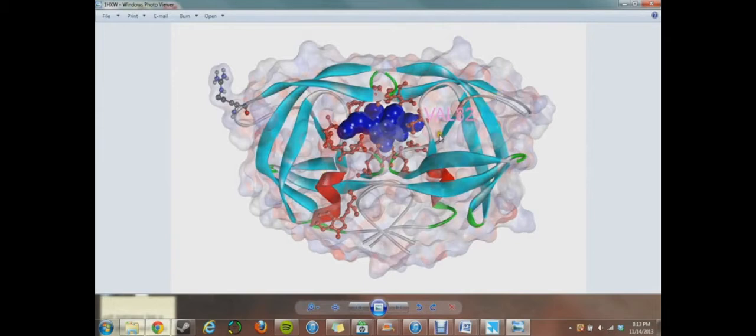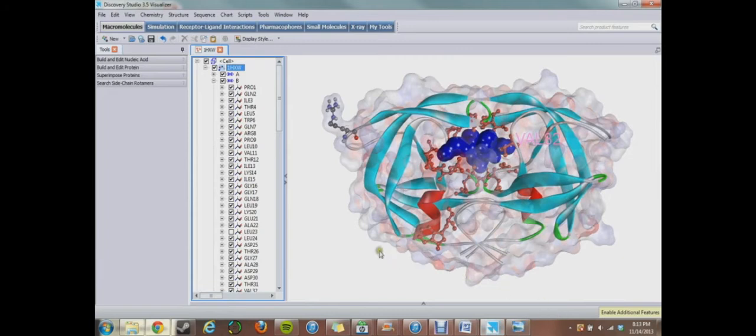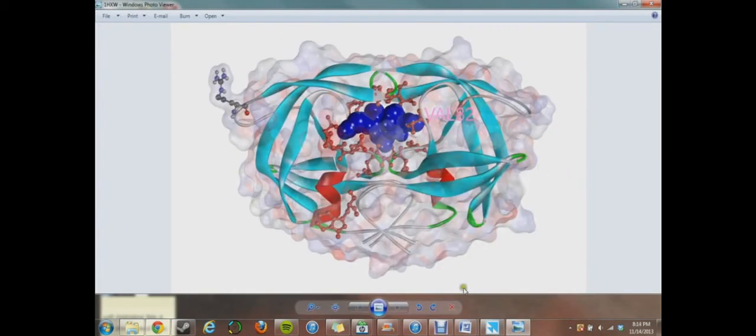The nice thing about having it ultra high and at such a big picture like this is when you shrink it down to put it in your appendix for your figures, it'll just have this nice glossy look. That's how you make an image. I know this was long, but hopefully this helped. If you're at this point, you know how long this went, and you also know that pretty much all I did was go over what is in Malachi's handout. So, yeah, those are both tools for you to use.